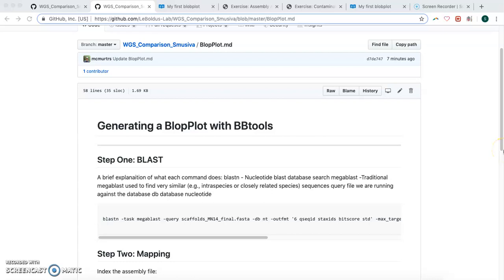Hi again, back for another exciting video. This video we're going to make a blob plot with BBtools.